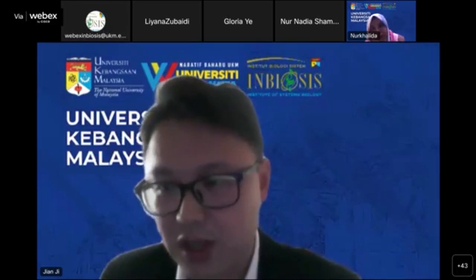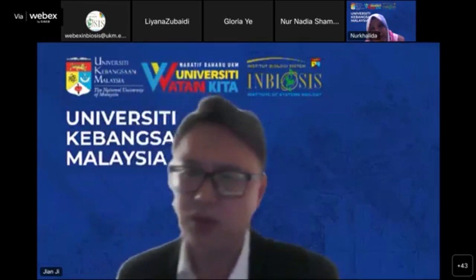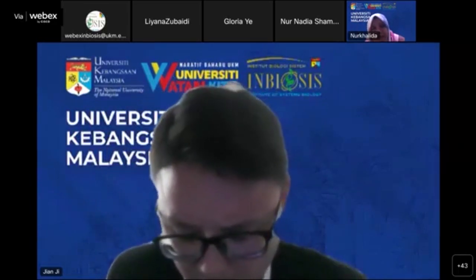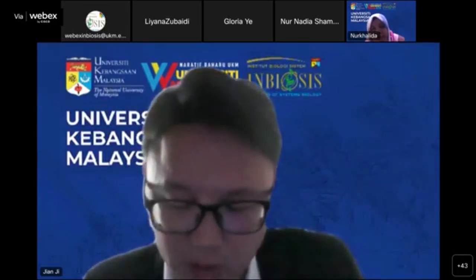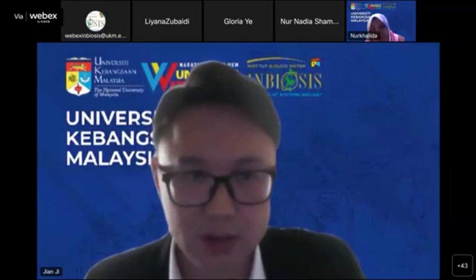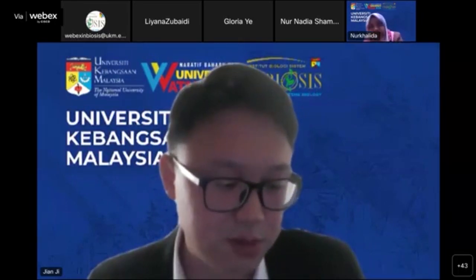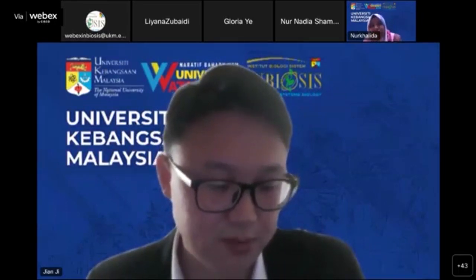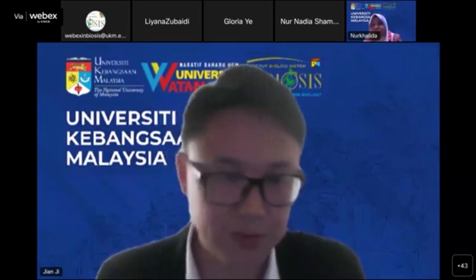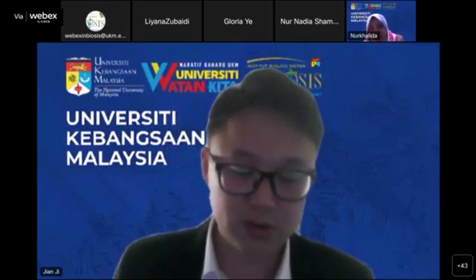If we use the targeted approach, it will be much better because we cannot annotate wrongly. We have the retention time tolerance, so it will be much better. But the problem is that the methods cannot be applied broadly, because the conditions in my lab and your lab are different. The method in my lab is okay, but for yours it is different.